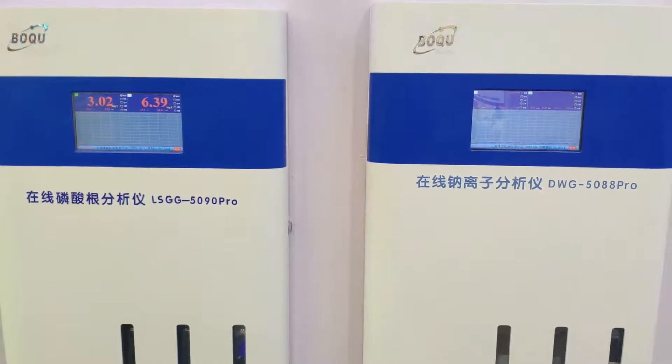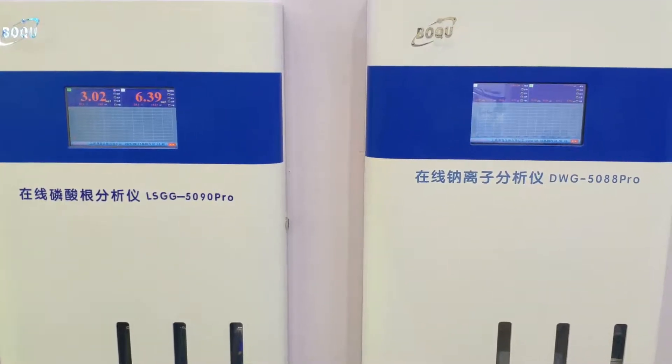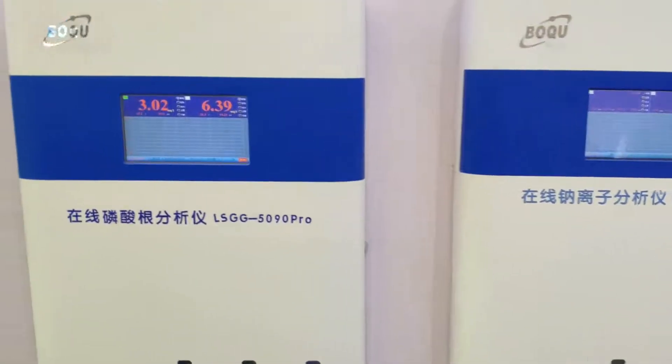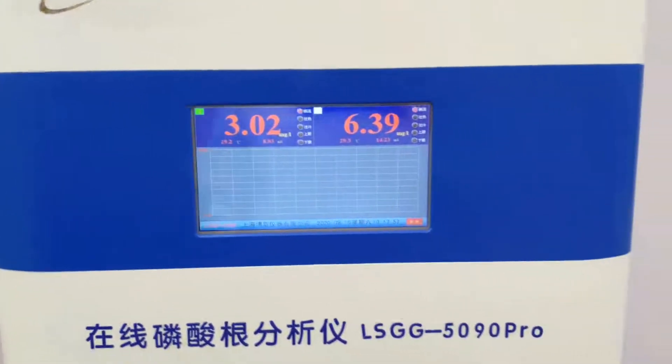The SWANS system is a steam sampler system used in power plants. It can be configured with six channels.